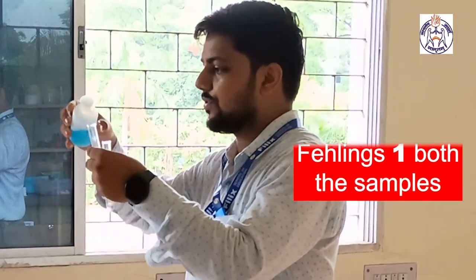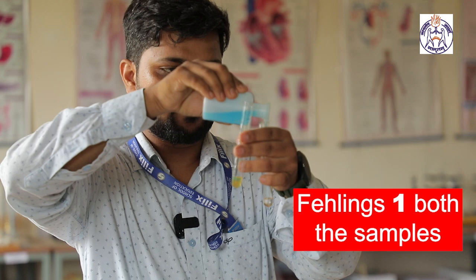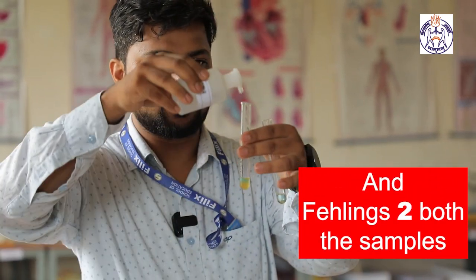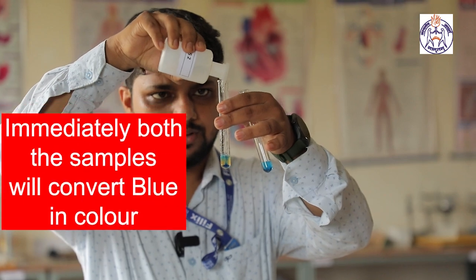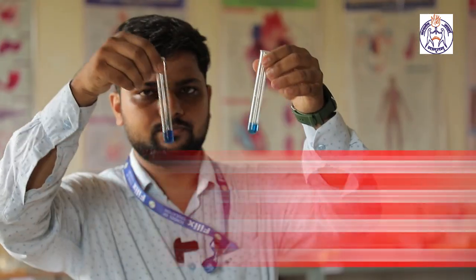What we are going to do is add a few drops of Fehling's 1 in both the samples, and then Fehling's 2 solution in both the samples. Immediately we can see that both the samples will turn bluish in color.